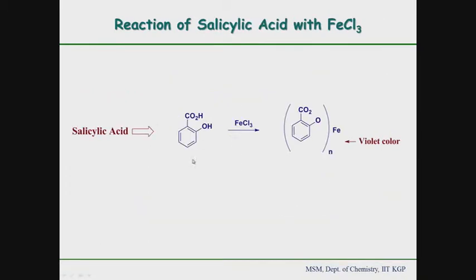For the third sample, salicylic acid, which is not that soluble, we have to use an aqua-ethanolic solution. Dissolve salicylic acid in 0.5 milliliter of ethanol and then add around 1.5 milliliter of water to get the aqua-ethanolic solution. Adding ferric chloride to this salicylic acid, due to formation of this type of complex, you will get a permanent violet coloration, which is totally different from benzoic acid, which gives a buff color.